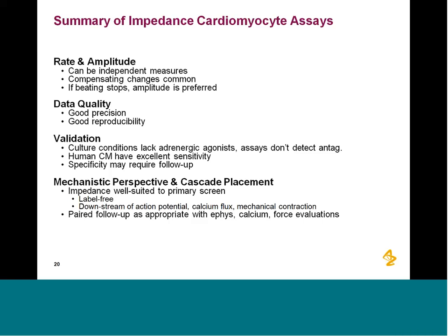Some of our misses come from the fact that we don't see beta adrenergic antagonists because there's no tone. We use dialyzed serum, and so there's no stimulation of adrenergic ligands there. So the validation looks good, even though I haven't shown all of it. From a mechanistic perspective, we think this is well placed as a frontline screen, and it will need to be paired with additional assays to look at mechanism of action.